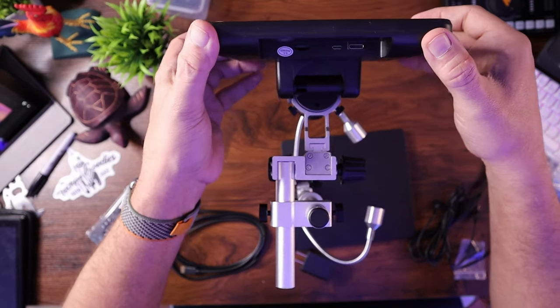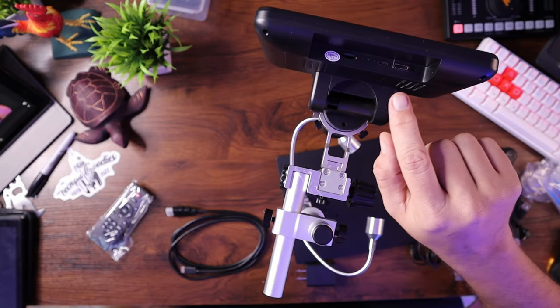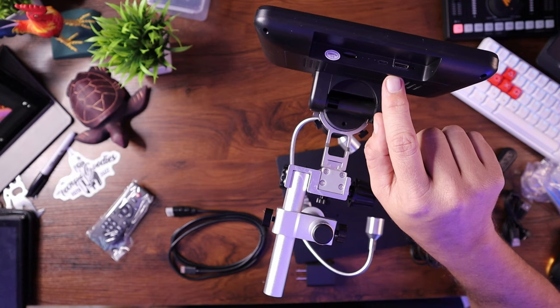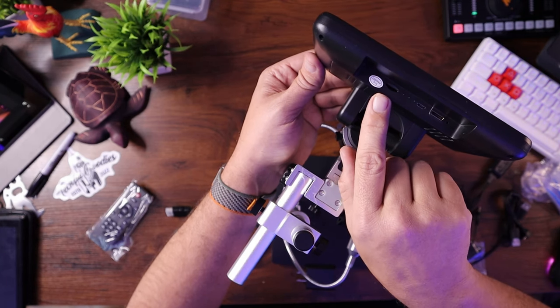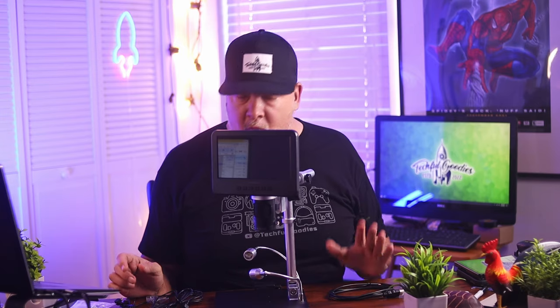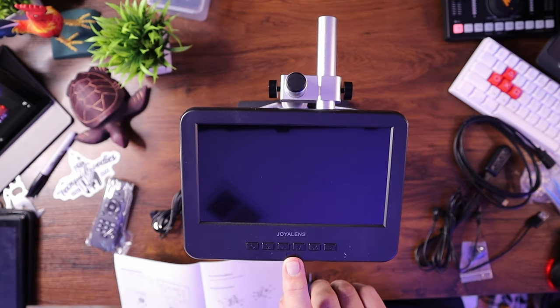Let's take a look at the top here. We've got an HDMI port, so you can plug this directly into an HDMI monitor. There's a micro SD slot, so you can record directly to the micro SD card. There also looks to be a micro USB port, which might be for power or for remotely controlling the device. And it's got different buttons across the top: one for power, one for menu, one for digital zoom in and out, and one to start recording.